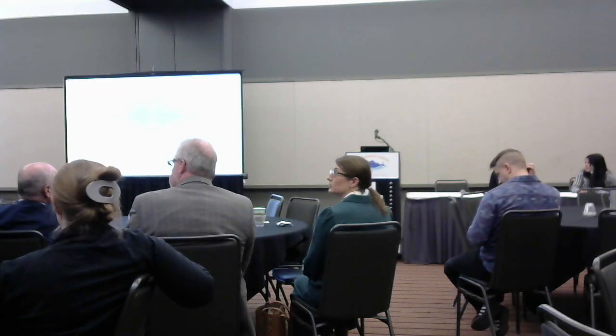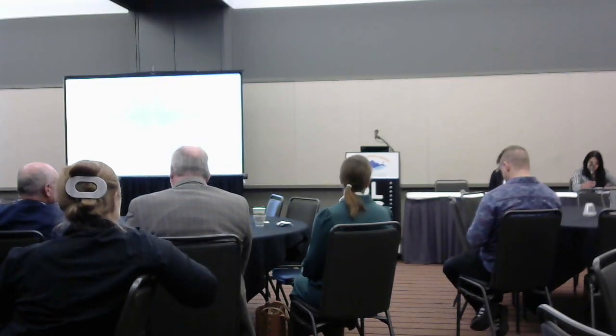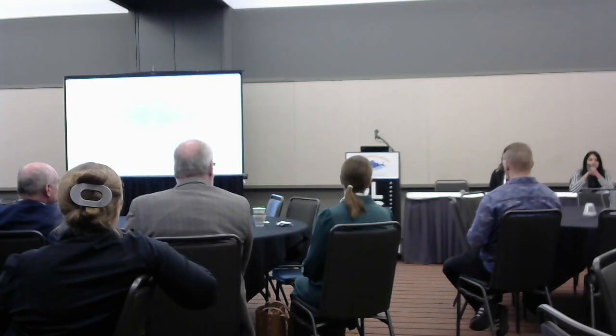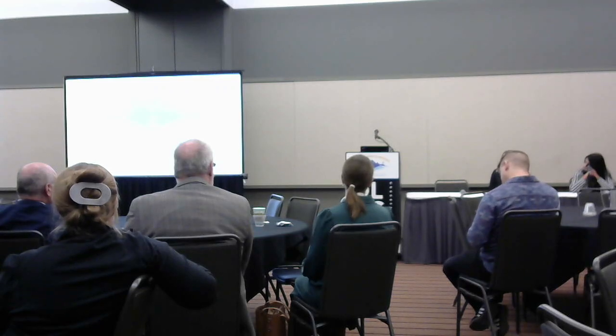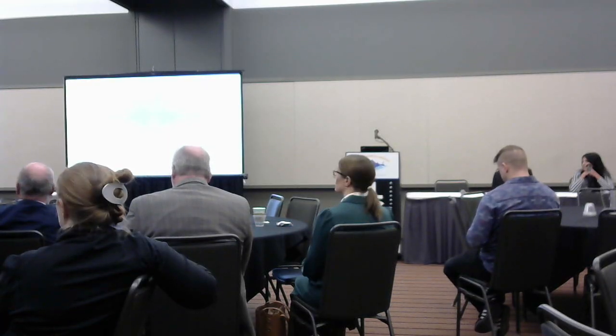Yeah. I will say that our HPC does have a desktop, so we can utilize Fiji in the GUI format through our desktop. I'm not sure how challenging it is to have your university or wherever you work set that up, but I think that is low-hanging fruit for at least getting people comfortable with the idea of going to a virtual machine. Okay. Thank you.